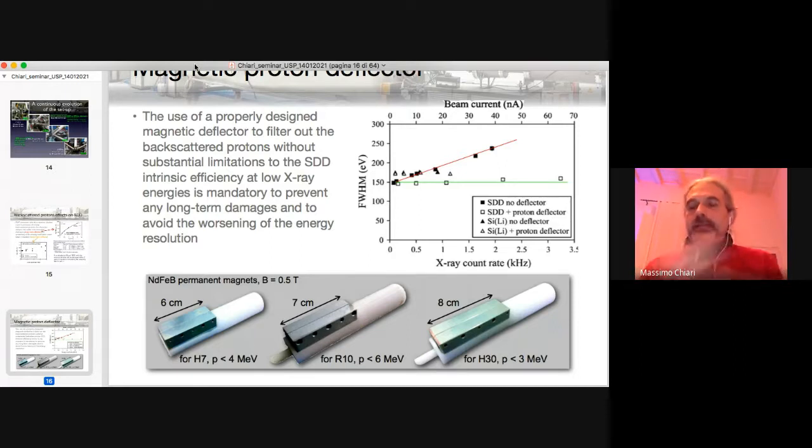Ancient meaning also 19th century, and this can be done also by PIGE. So we are analyzing a lot of collections to try to reinforce this idea.